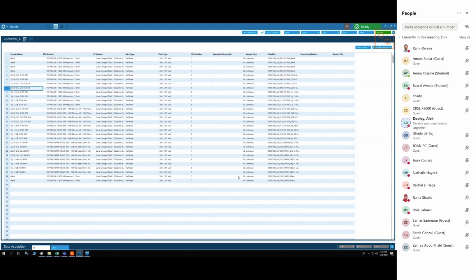We will take a quick look at the swath data in the analytics, and then you can make a decision how you want to proceed. Do you want to continue in the analytics with an unknown processing, so to try to find the compounds without giving the formula, or do you want to go to the explore mode? So you guys can make that decision how you want to proceed, and whichever thing we don't do, we'll just do it after.